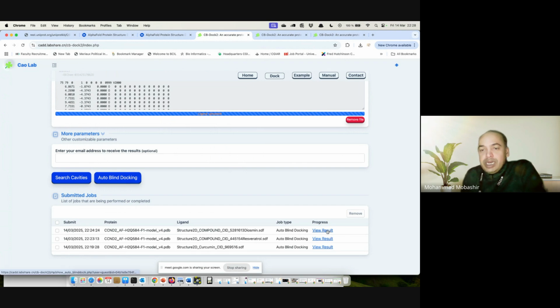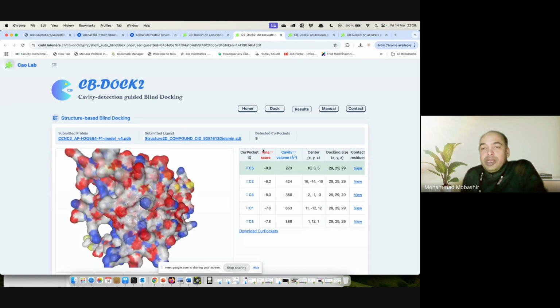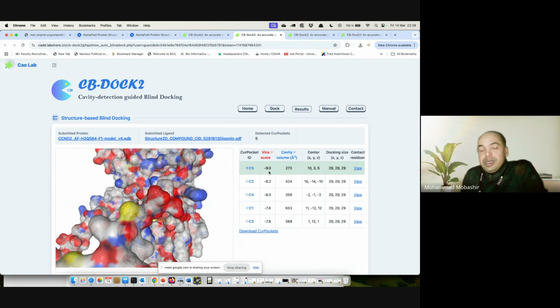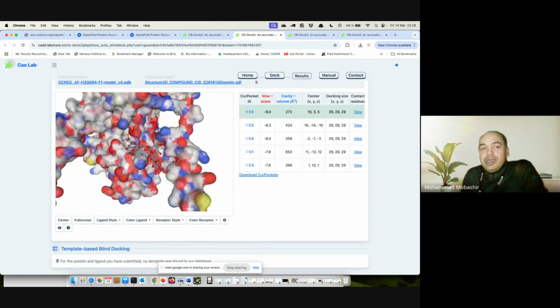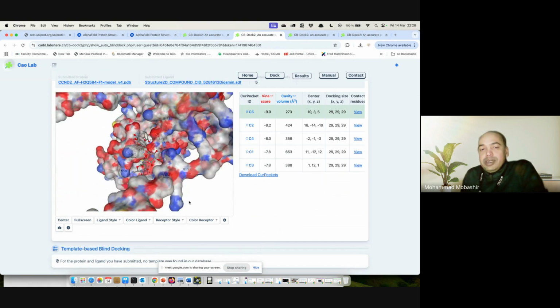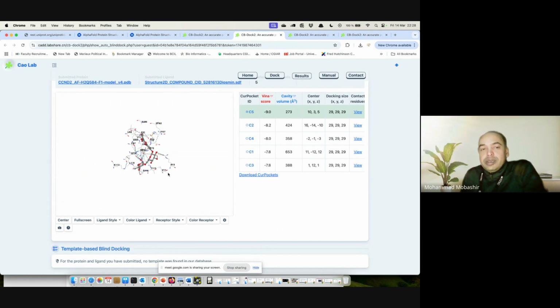So it is done now. Let's see how many values they are displaying. Exactly. It's a good one. Minus 9. And if you compare or analyze the binding sites, you will find they are binding in different cavities, which you can see here. And then again, hide the receptors.